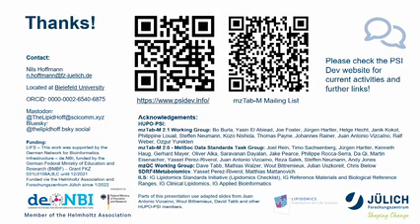And then you would have these different community-specific validation profiles that allow you to say, okay, this conforms to the minimal information required by the Metabolomics Society, by the Exposomics community, or by the Lipidomics Society, and so it can go into this or that repository. It also tells you what's still missing in the validation. So I think that's really the important part.